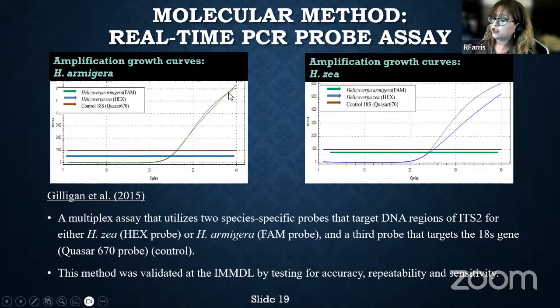Now, the internal control, we have to use in every PCR reaction that we do. If there's amplification of the internal control, that will tell us that the PCR assay was a success, all right?